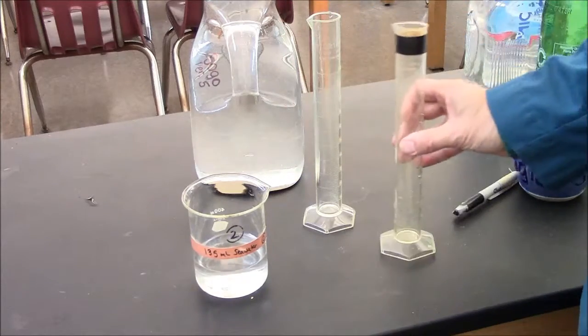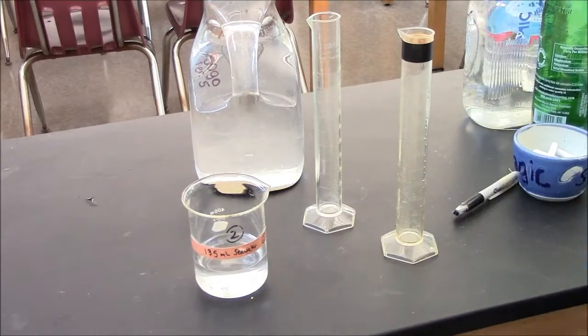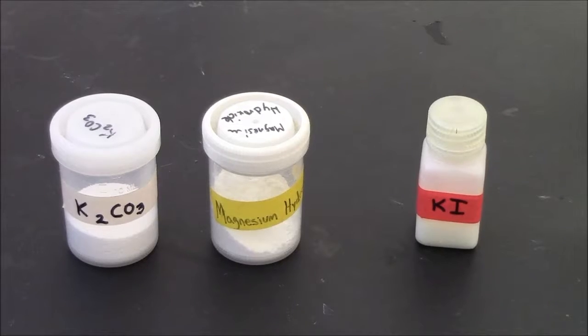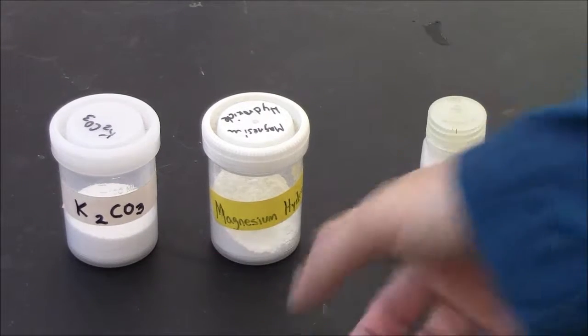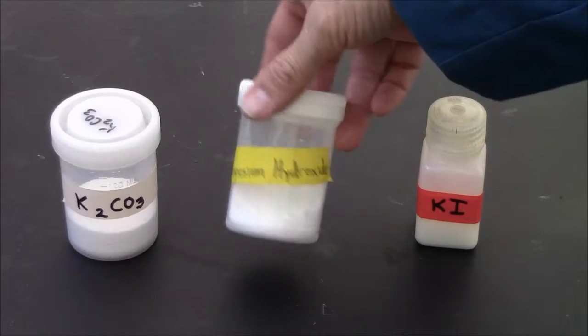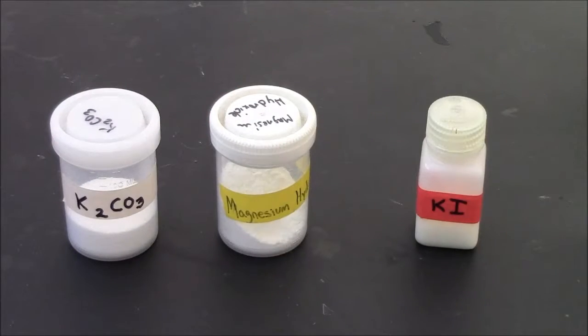Each beaker will have a different volume of seawater, so read your label. The buffet table will provide you with a variety of salts. Some may be labeled with a formula, some with a name. You should know how to translate name into formula and vice versa.